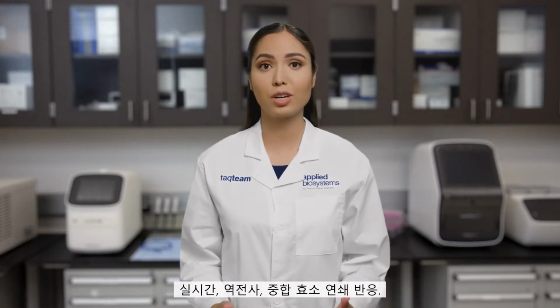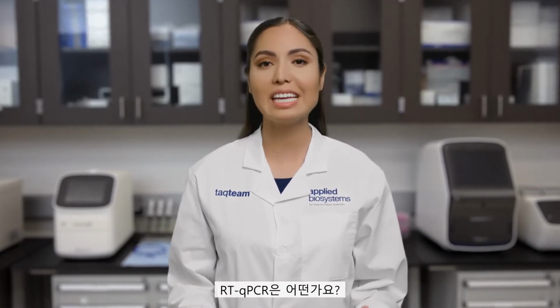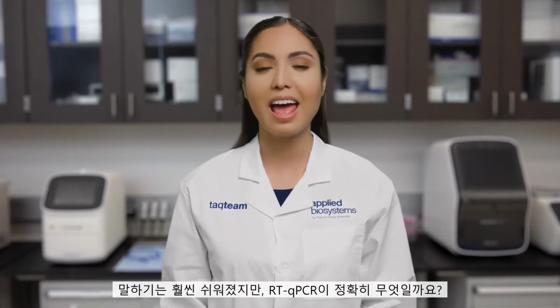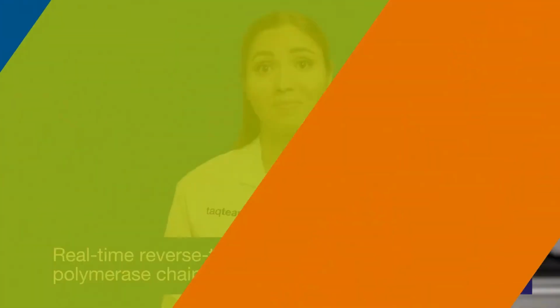Real-time reverse transcription polymerase chain reaction. Phew, that was a mouthful. How about RT-qPCR? Well, that's certainly easier to say, but how exactly did we get from there to RT-qPCR? Well, that's a great question.